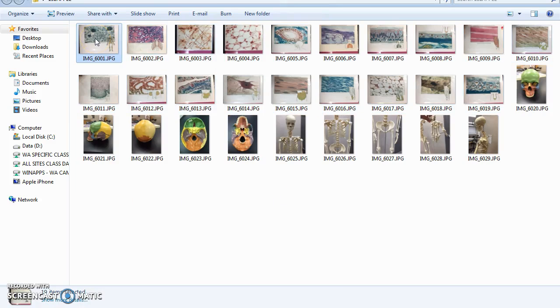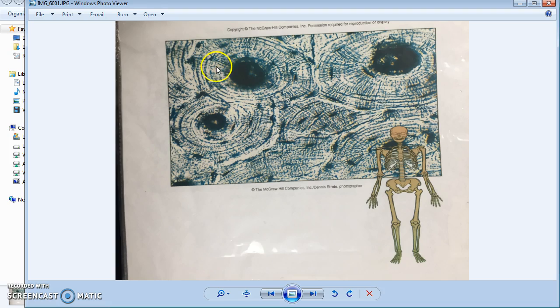Alright, so here is a practice run through for some of the tissues for the lab. One of the things you'll notice is that there will be a reference picture in the bottom corner of these 8x10 color photos that we'll be testing you on. I'm just going to quickly go through them, and then you can use this as a study tool. They're also uploaded into the Blackboard shell, as far as these pictures that you will be responsible for knowing the tissues for the lab portion of the AP1 class here at Baker.